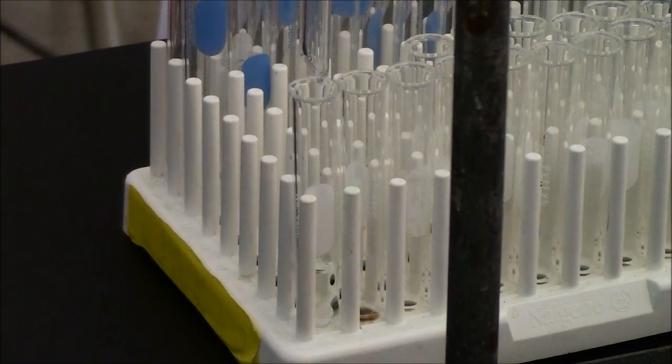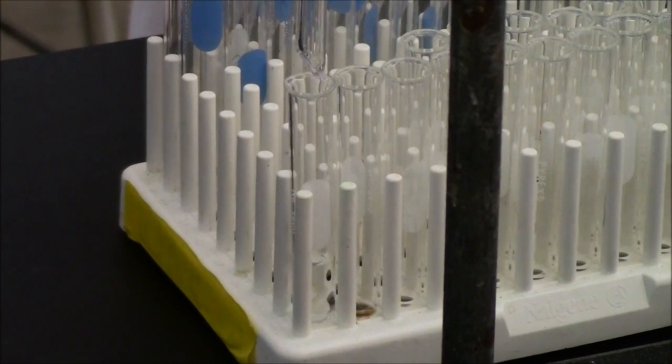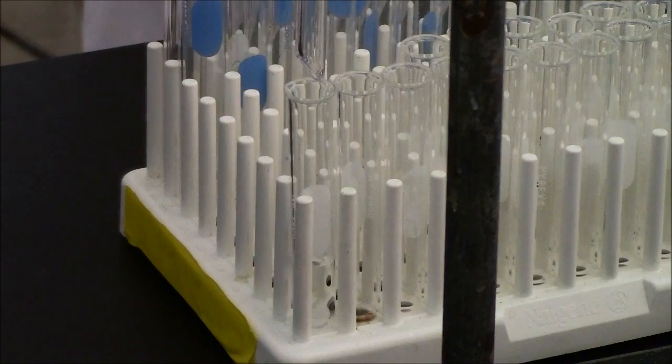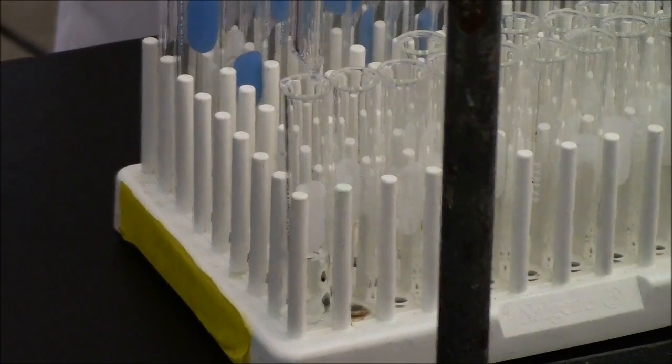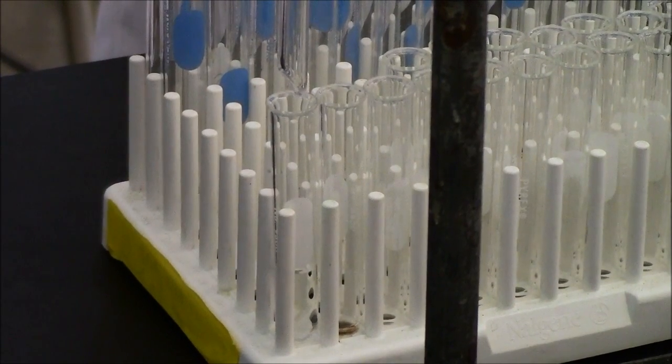This is a nice flow rate. You can see drip, drip, drip, drip. So we probably have about 1.5 mils per minute. That's a good flow rate.